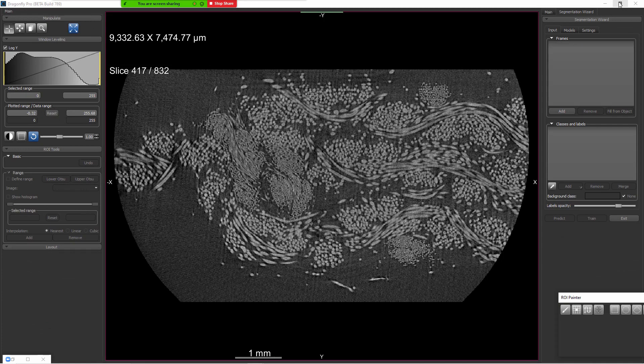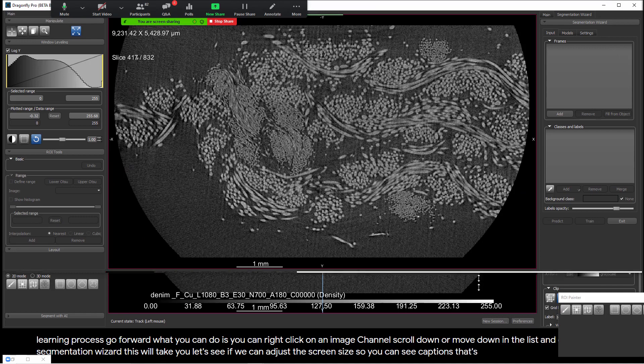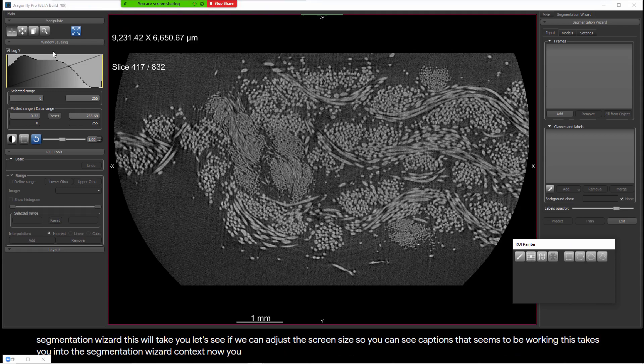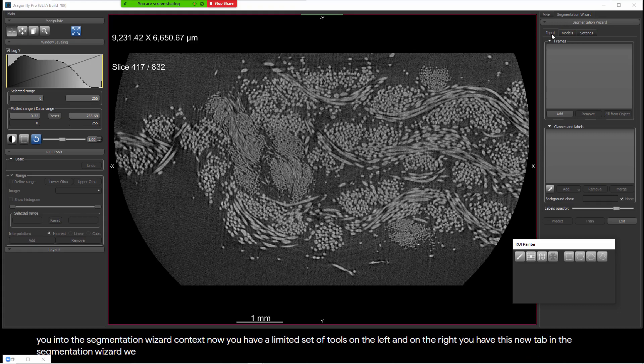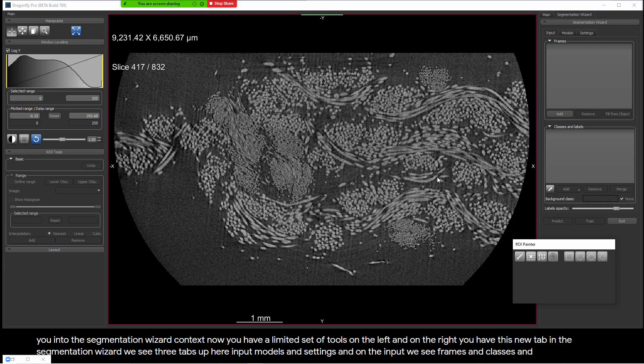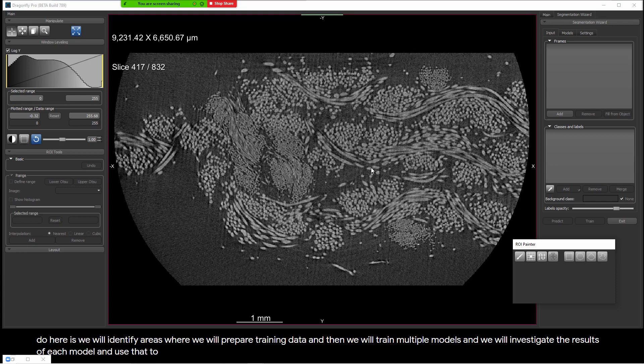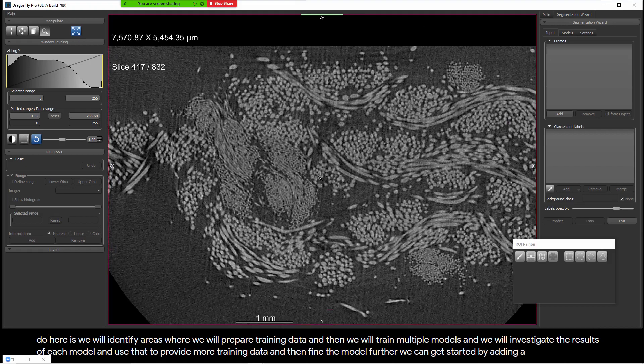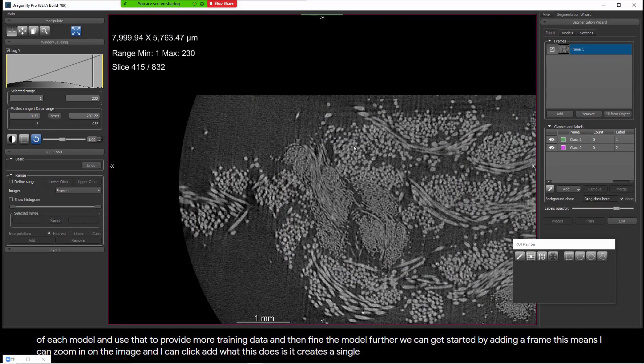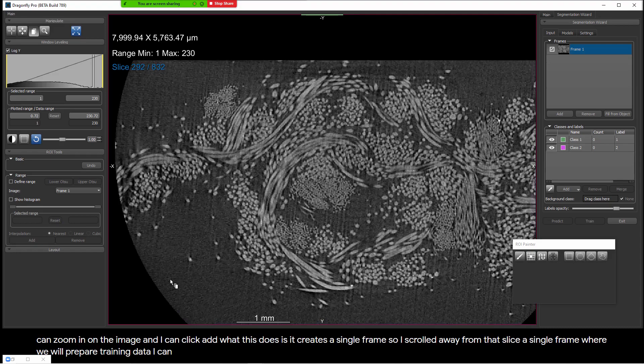The Segmentation Wizard allows us to make the deep learning process go forward. What you can do is right-click on an image channel, scroll down the list, and choose Segmentation Wizard. This takes you into the Segmentation Wizard context. You have a limited set of tools on the left and on the right you have a new tab. In the Segmentation Wizard we see three tabs: Input, Models, and Settings. On the Input tab we see Frames, Classes, and Labels. We can get started by adding a frame — this means I can zoom in on the image and click Add, which creates a single frame on a specific slice where we will prepare training data.